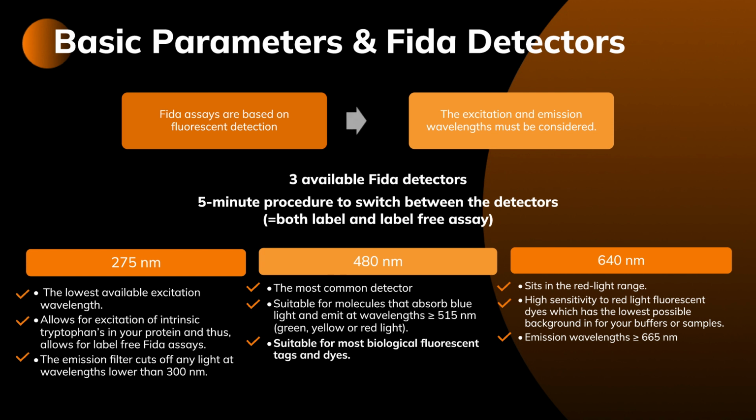This particular excitation wavelength is suitable for molecules that absorb blue light and emit at wavelengths greater than 515 nanometers, meaning green, yellow, or red light. This particular wavelength is suitable for most biological fluorescent tags and dyes.